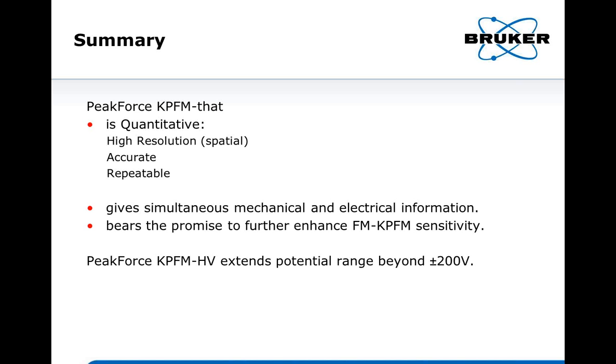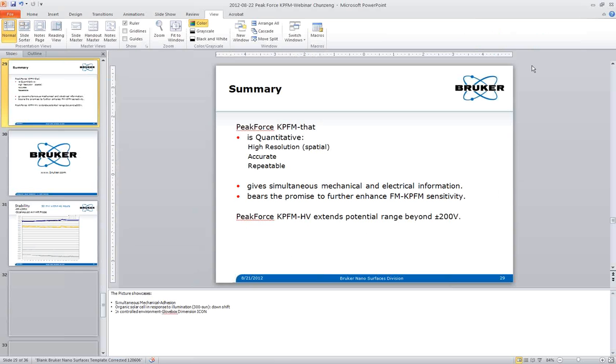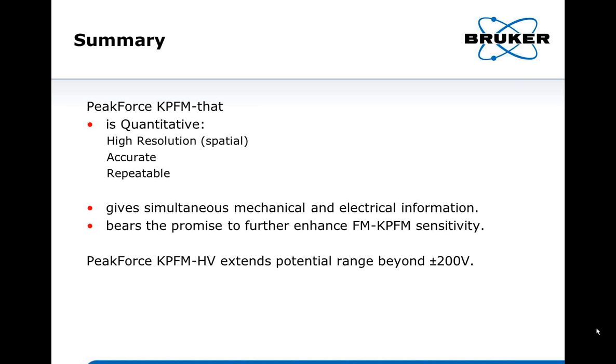Let me start from the bottom up here. Vacuum conditions versus glove box: in vacuum you get a higher Q. Do you have that too? Do you get vacuum in the glove box, or what other advantages do you have in the glove box? In the glove box, we don't run in vacuum. The pressure is around ambient pressure, so we don't leverage Q there. No vacuum there.